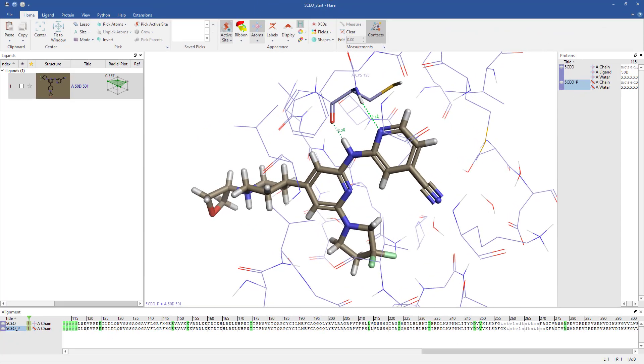Flare features the ability to perform confirmation hunts and ligand-based alignments on molecules as a way of making meaningful comparisons across chemical series.